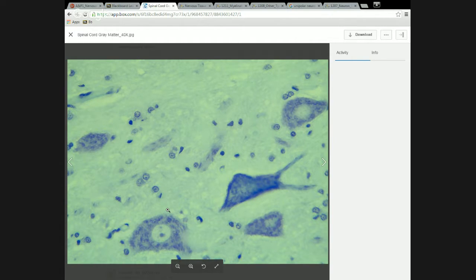Okay. Now, this cell next to the one I've been talking about, this one off to the side, we don't really see clearly where its nucleus is because we've probably not cut through the middle of the neuron, but we can see a fairly distinct branch going off this way, and the hint of something probably coming off this way, and there might be something coming off of this bump right here.